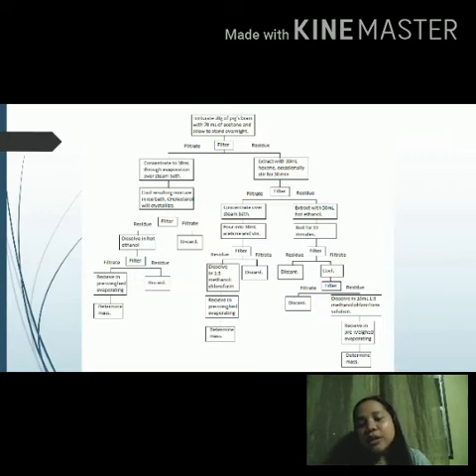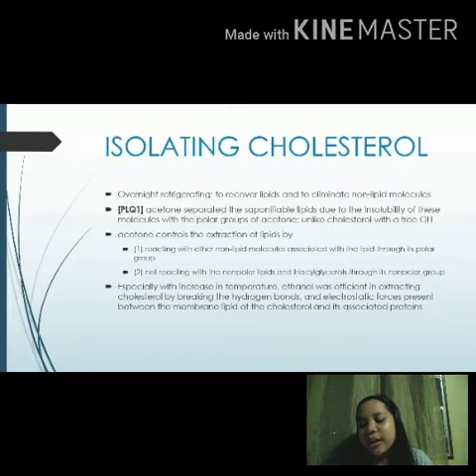The filtrate was discarded and then the residue was used as it was the crystallized cholesterol. It was dissolved in a minimal volume of hot ethanol, filtering while the solution is hot, and was then allowed to cool in a pre-weighed evaporating dish as a receiving vessel.